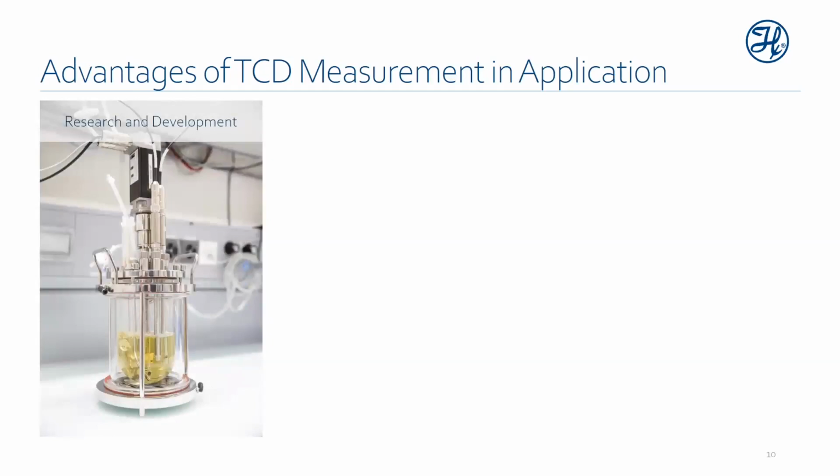Inline TCD measurement has distinct advantages that are present not just at, say, the R&D scale, but also through pilot and production. But I'm going to go ahead and delineate them out. So at the pilot or at the R&D scale, inline TCD measurements enable you to implement process control capabilities in what may have been historically limited to just grab samples and making a measurement.